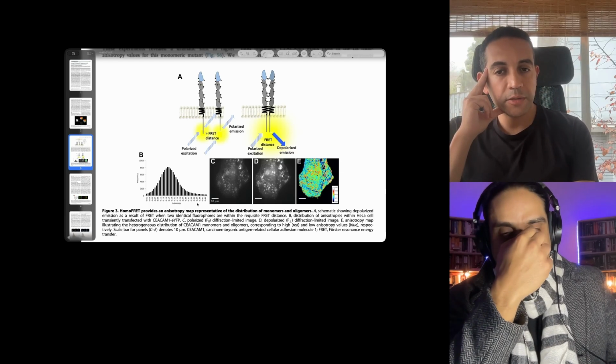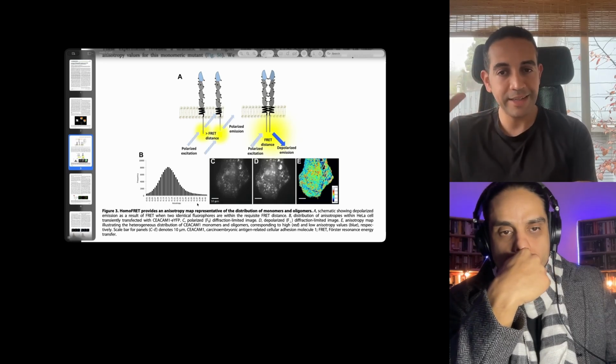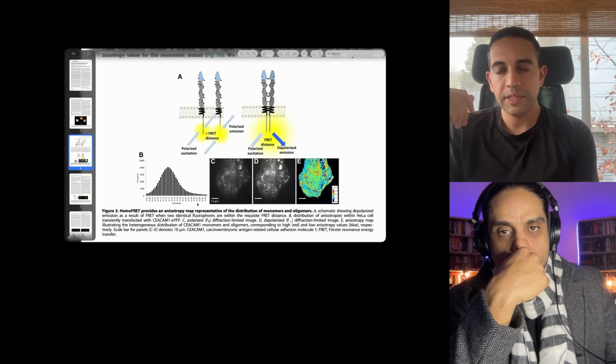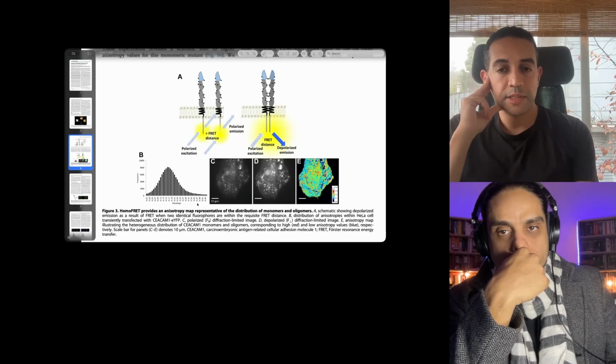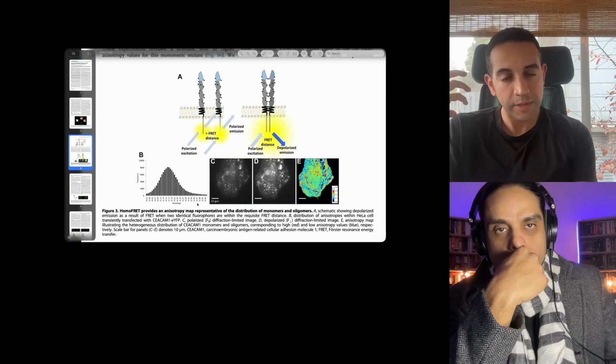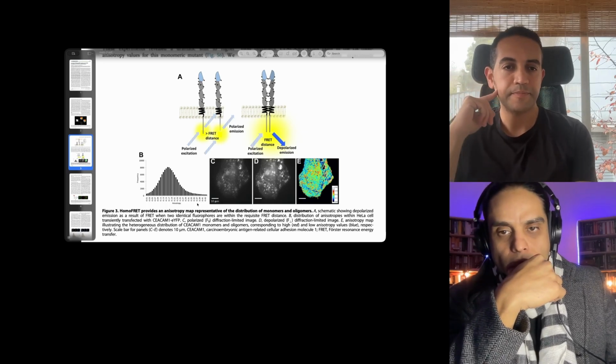And it's quite a contortionist effort to make sure that, again, day in, day out, the cameras are aligned, and you can do that with, like, you take beads, for example. There are easy ways to make sure that your cameras are aligned. You also want to make sure that your cameras are as sensitive as each other, that there isn't one where the chip on the camera has lost sensitivity and whatnot. You want to make sure that they are at the same level of calibration.